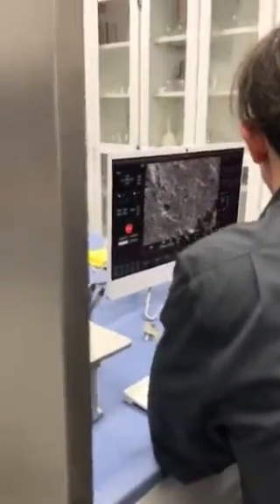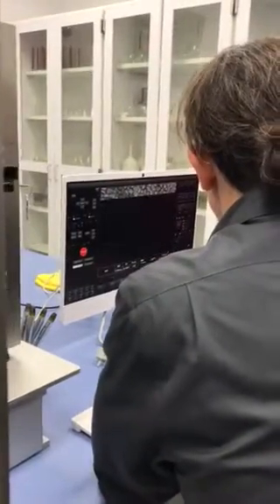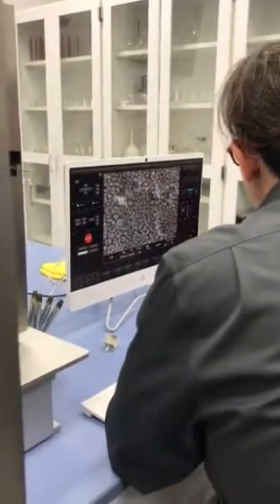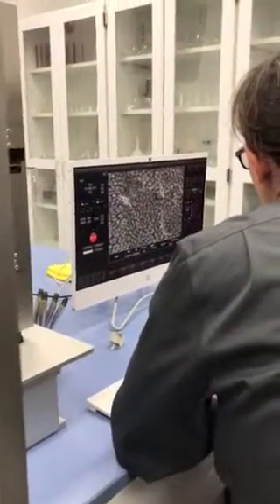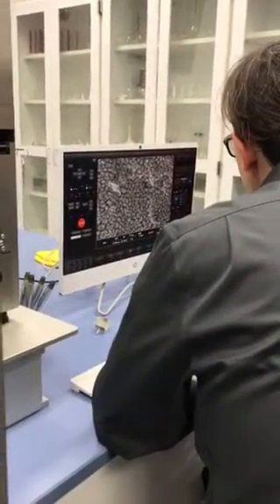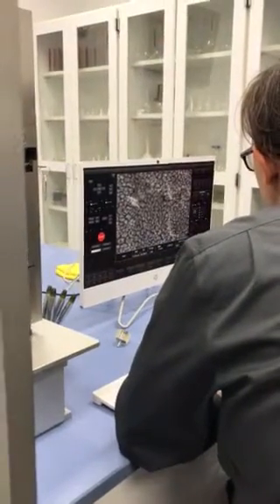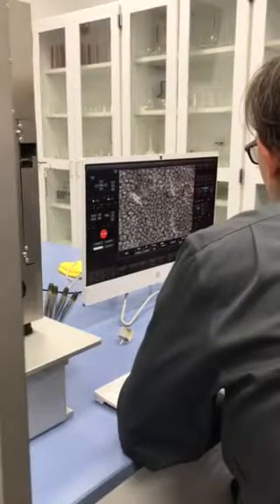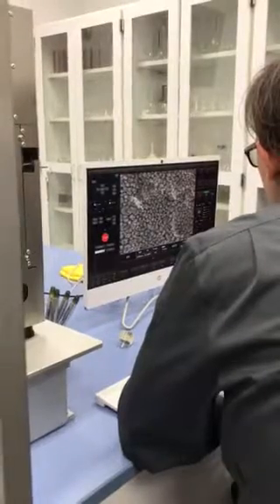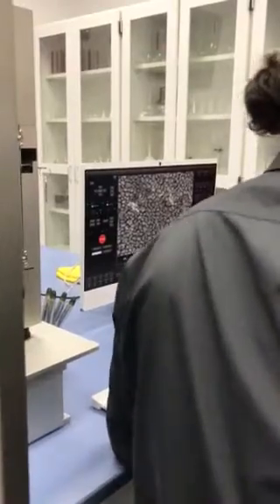So 6,000x is great. We can see that, and if we come up a little bit more, we're hitting around 26,000x. Right now I have one of my samples in, and then we're going to put one of Dan's samples in — the real sample. But this sample I have in here is kind of like an industry standard. Dan has seen this sample many times when I try to prove to Dan that his microscope is clean, it's working, everything is doing what it should do. This is the sample we use. It's an industry sample — gold sputter on carbon.